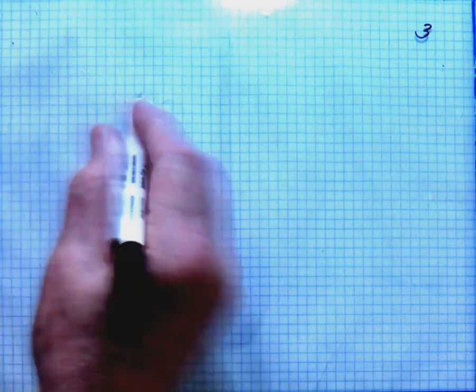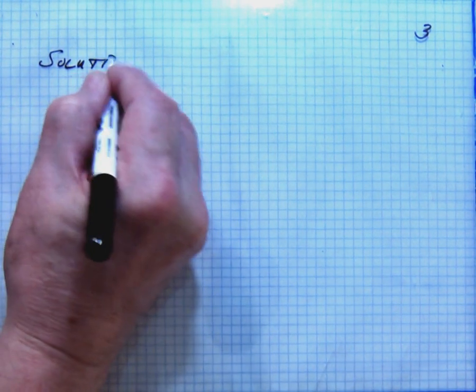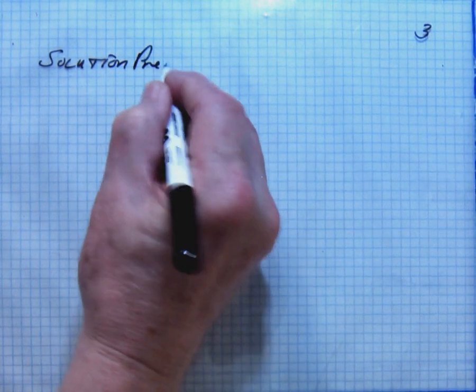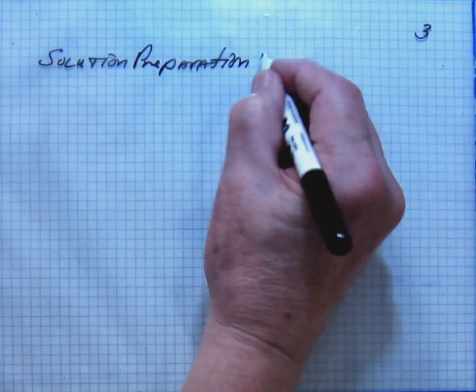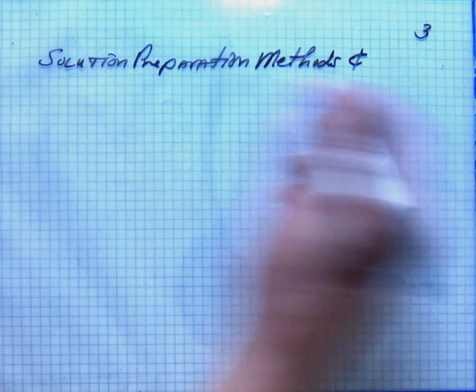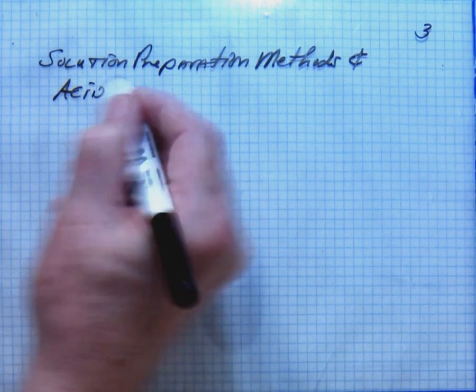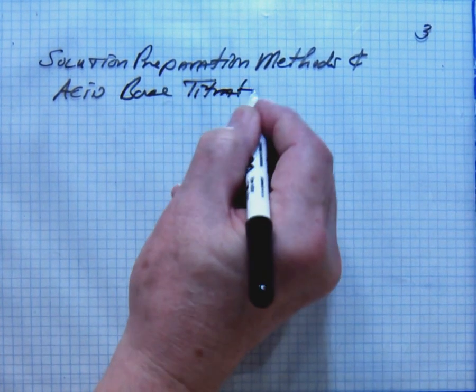Okay, so we're on page 3. Okay, and this is solution preparation methods and acid-base titrations.